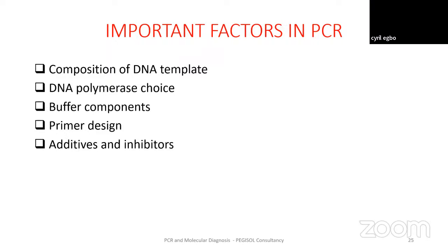I don't want to digress further into this composition, but just understand that most times, because of this, either the shorter or the longer, there may be incomplete separation, there may be a lack of specific binding of the primer.